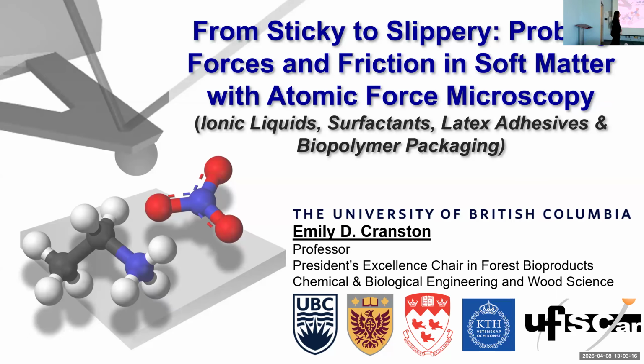Excellent. Thank you so much, Ben. Thanks for the invitation. It's great to be here, and good afternoon, everyone. Thanks for joining. I'm really excited to tell you about AFM today, atomic force microscopy, and going beyond using this as an imaging tool, to think about how we can measure forces and friction. Because the AFM is pretty unique in that we actually are making physical contact with our samples. So it means there's a lot of information that we can learn.